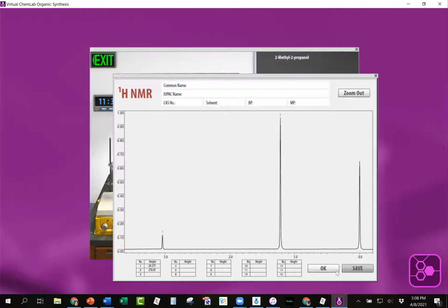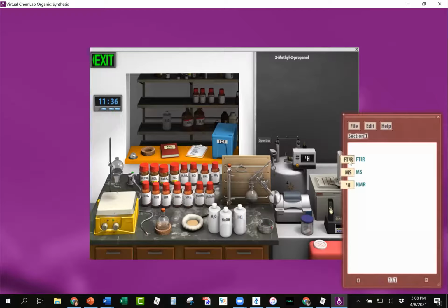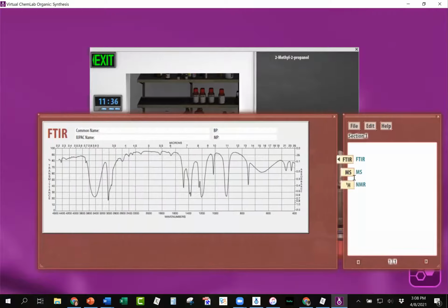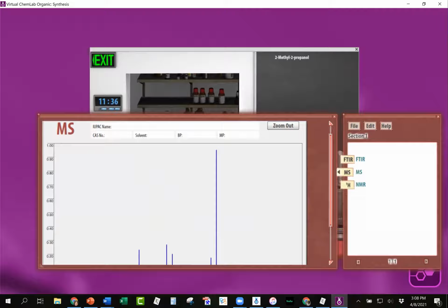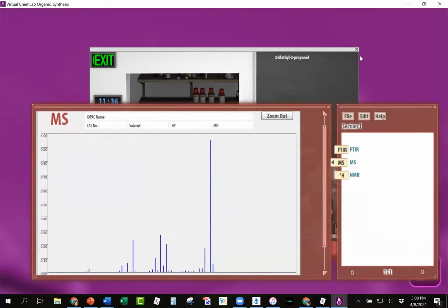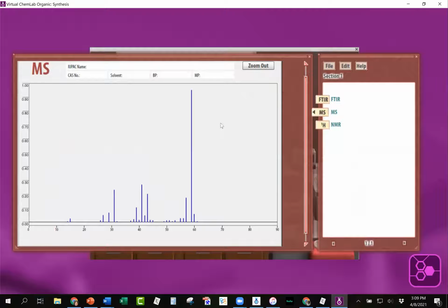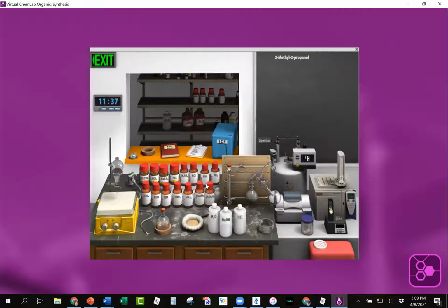All of these things can be saved to their lab notebooks, which can be found here. They just have the spectra here, and this can be stretched out. These are things that I didn't know right away, but have found later on to be helpful. The size of these windows can change so that you can either have students turn in the lab book, we talked about the panelists earlier that they have problems saving these, or they can do a nice screenshot and get all of this information in here as well. So there's the NMR that the students took.